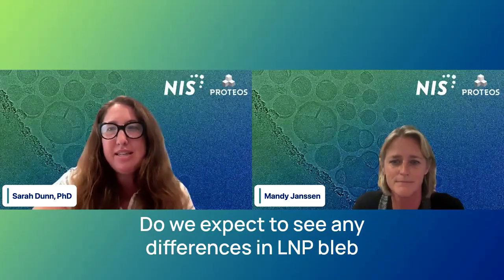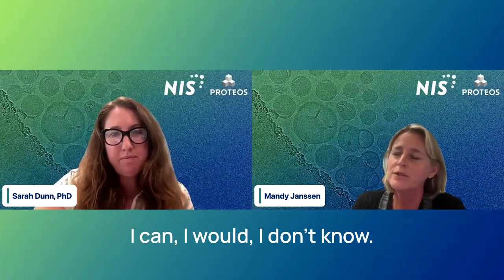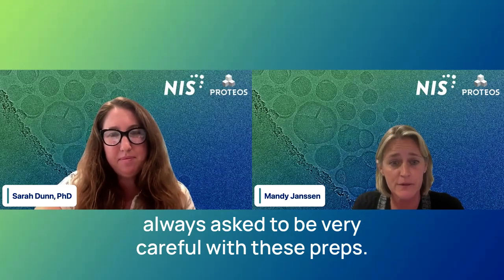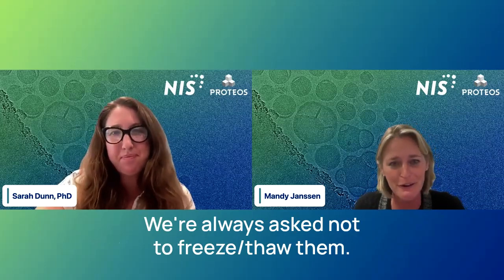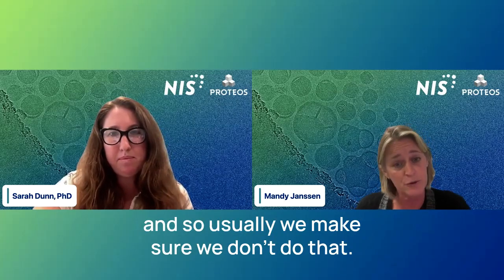Do we expect to see any differences in LNP bleb formation as a result of any freeze-thaw cycles for LNPs? I don't know. It depends on the formulation, I think, but definitely we're always asked to be very careful with these preps. We're always asked not to vortex. We're always asked not to freeze-thaw them. So I can imagine that these are very precious samples, and so usually we make sure we don't do that.